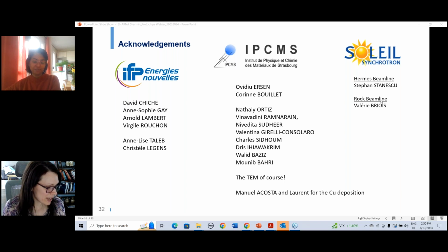Good, good. And then we have one final question. If anybody else has any questions, go ahead and enter it in your chat box now. Have you ever considered analyzing the gas output with your reactions? It sounds like the activity wasn't too important in this particular case, but would there be any benefit to mass spectrometry with an experiment like this?